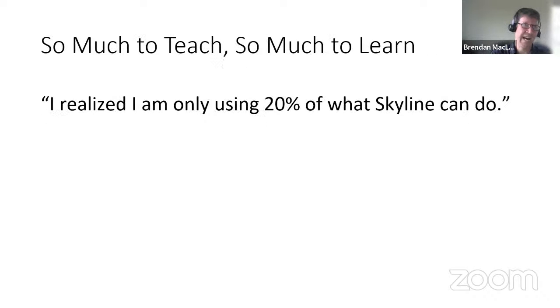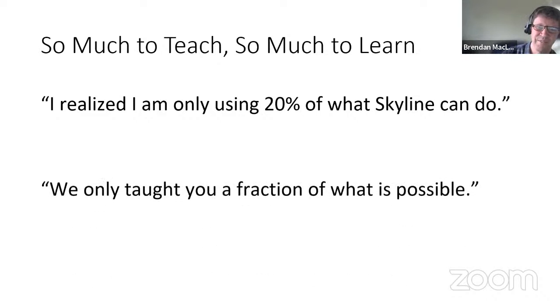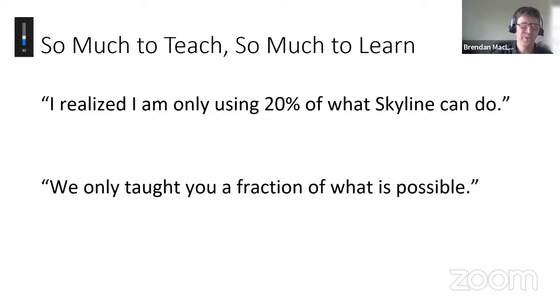So yeah, so much to teach, so much to learn. I love this quote. This was in Barcelona after the 5-day practical course, which is a great option if you're in Europe. And hopefully the Barcelona course is coming back in person this year. But this person said, I realize I'm only using 20% of what Skyline can do over dinner after the course. And my response was, we only taught you a fraction of what's possible. So, maybe you're only using 5% of what Skyline can do.